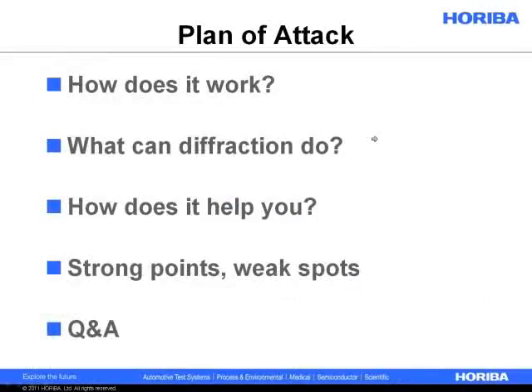So here's the plan of attack for today's presentation. We're going to cover how laser diffraction works, what it can do for you, how that ultimately helps you do your job better, what the strong points are, and more importantly, what the weak spots are. A lot of times vendors don't like to focus so much on what the weak points are, but they're important to understand. And then we're going to finish it off with a Q&A. But the first thing we're going to do is talk about how it works.